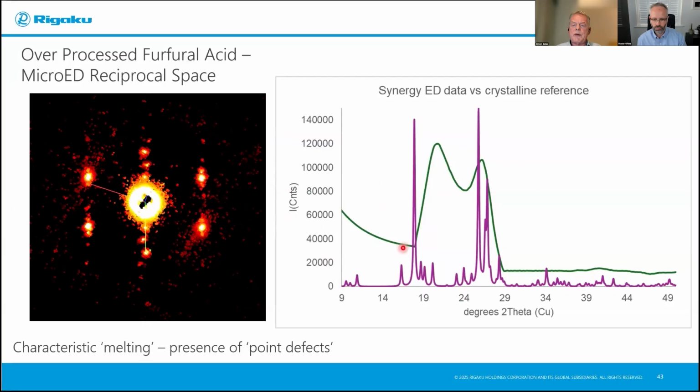We can again export the data in total diffraction or powder format, that's in green, and we can compare that to the pristine material. And you can see that there's some serious changes going on there in this material as it's disordering.